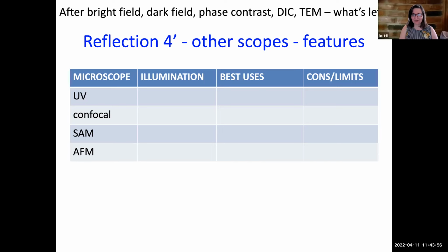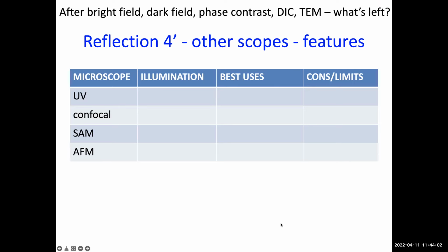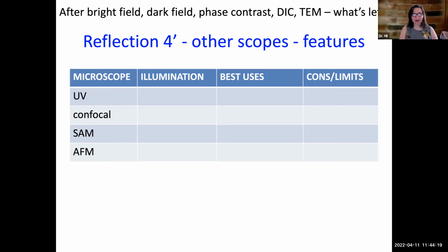Excellent. Now, before I say anything about it, does anyone have anything they want to add? Haley Kronberger, go ahead. Can you hear me? Yep. Okay, I remember from the lecture that it was cool because it can illuminate each plane of a specimen, really precisely. Yes, and that's exactly how that high resolution is derived, by doing optical sectioning and then reconstructing it with a computer.